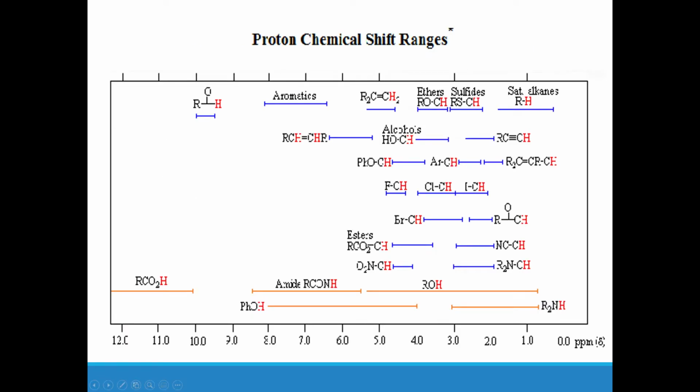Here I have a table that gives examples of some more widely seen functional groups that can appear on molecules. While we could try to memorize exactly the locations of all of these functional groups, I think it's more important for you to understand how different parts of the molecule have an effect on other parts of the molecule.